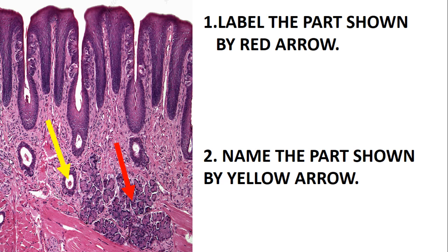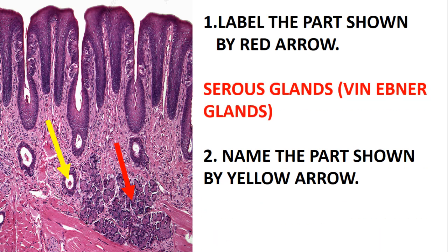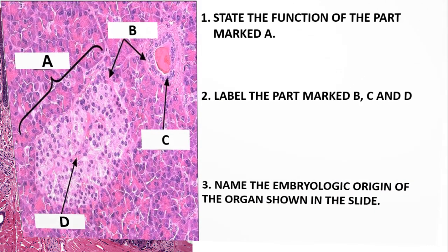The next slide asks you to label the part shown by the red arrow. This slide is just a slide of the tongue — you can see the taste buds there. The red arrow is pointing at the glands, which are the serous glands also known as von Ebner's glands. The part being pointed to by the yellow arrow is just the duct of the gland.